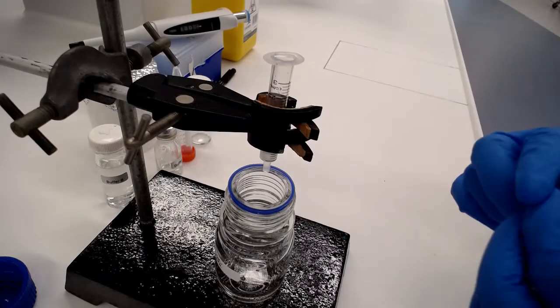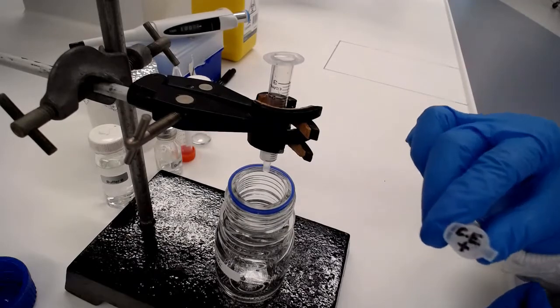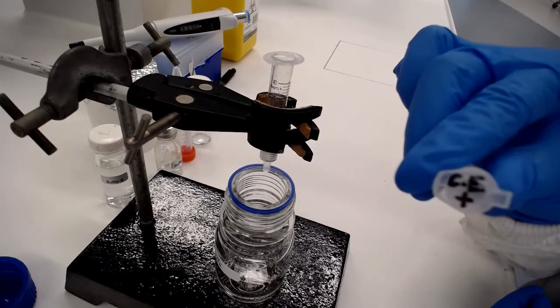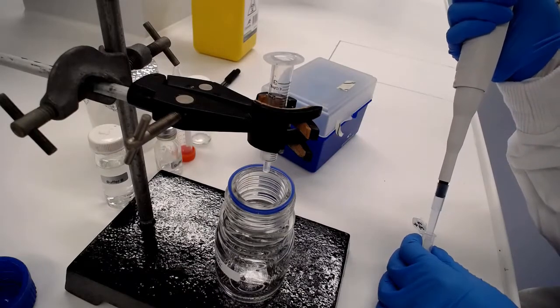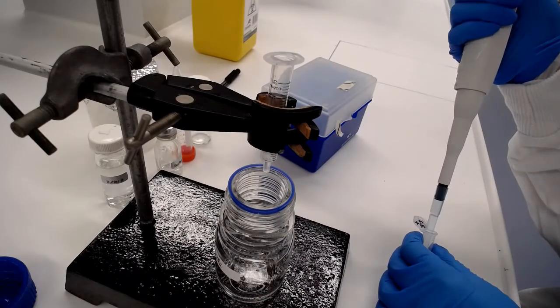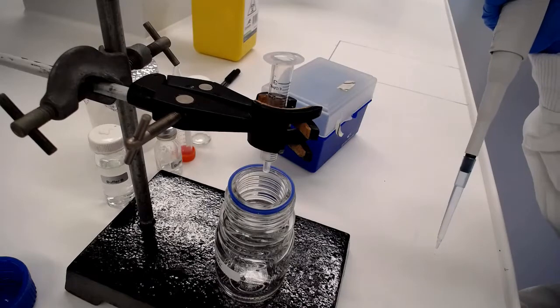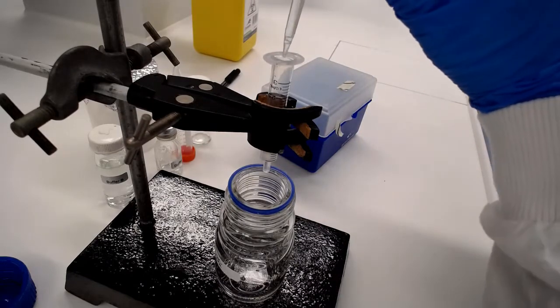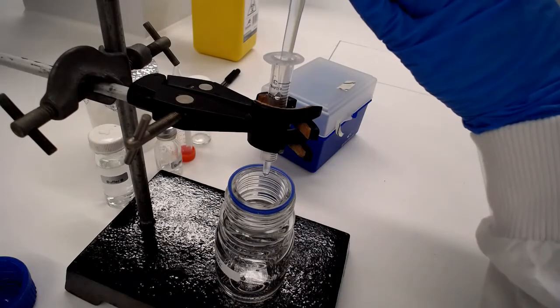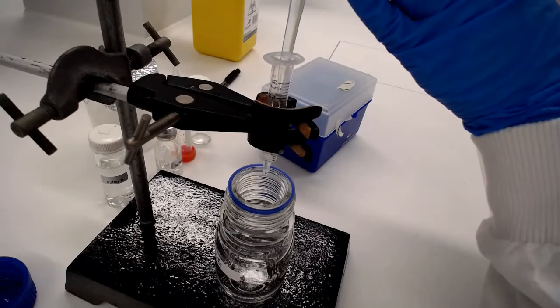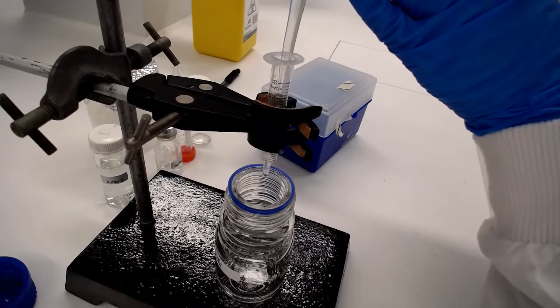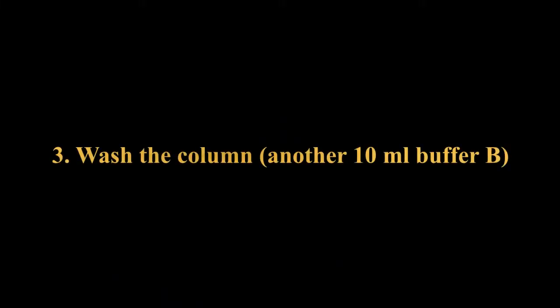Here's our heat-treated and centrifuged cell extract and it's now ready for affinity chromatography. We're going to use the P1000 pipette to get the solution out of the tube, just easier because the tip gets down better into the bottom of the tube. Same idea of adding the cell extract gently and slowly to the top of the column.